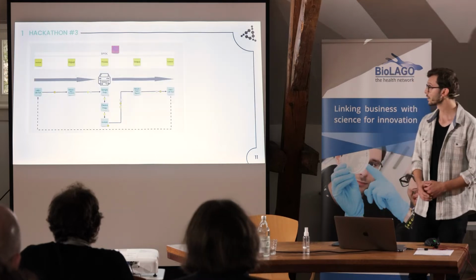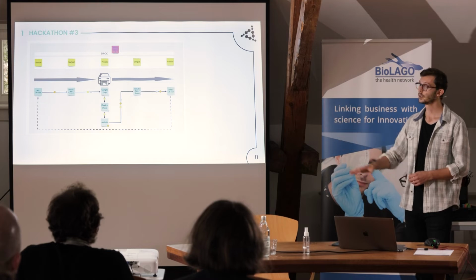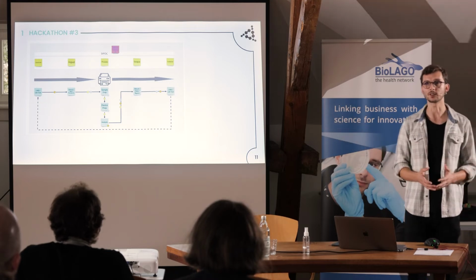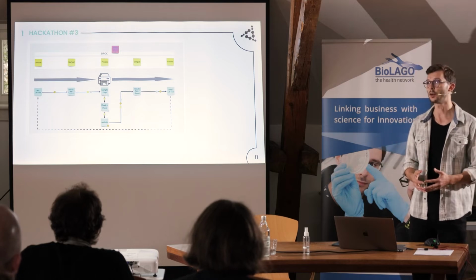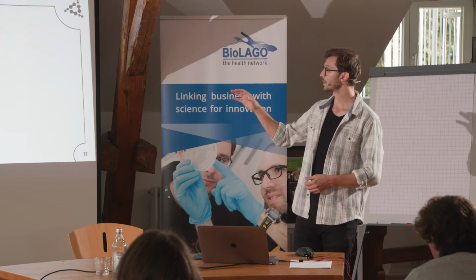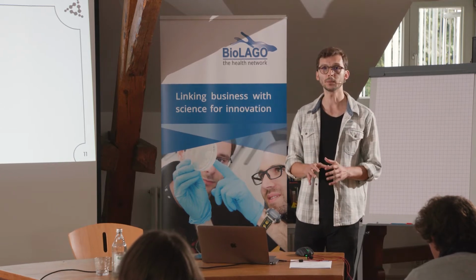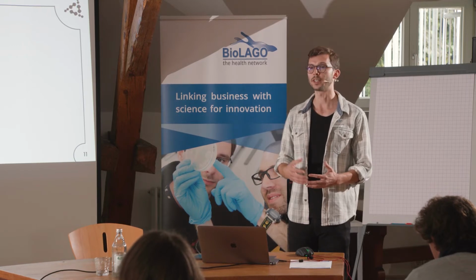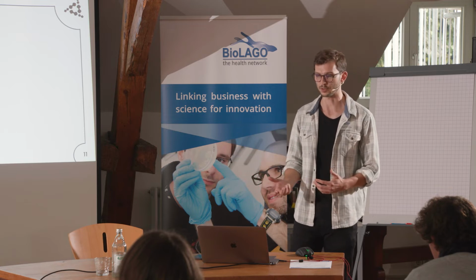What we also did in parallel at the third hackathon was to break it down based on SIPOC. It's a Lean Six Sigma management tool to break processes down into single steps. What we did was to collect different methods in the laboratory and combine them to build a generic user interface so that users can easily connect devices with their LIMS system.